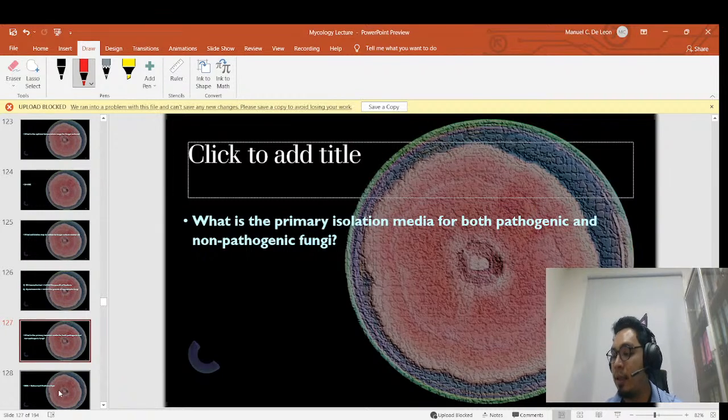So we don't make our own culture media here in our hospital because the standards are different than in many other countries. I think in the Philippines the standards are not as strict when it comes to making culture media, but in countries such as those in the Middle East, they would usually require another person on duty just to make culture media and another one to process clinical samples.